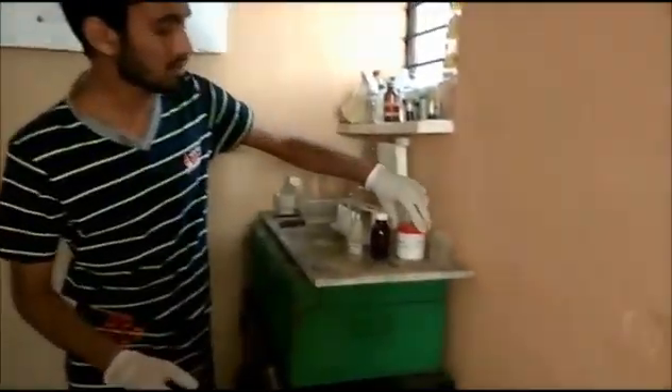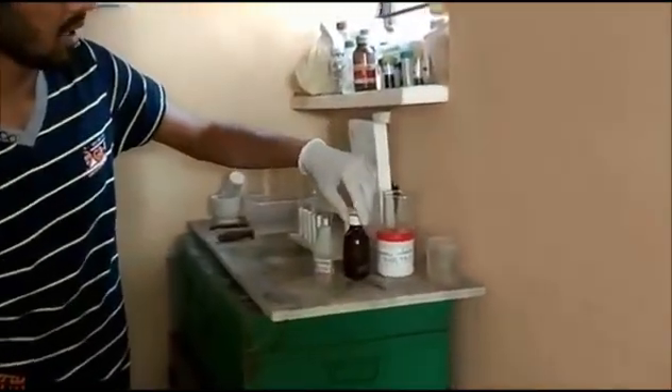In this video we would be doing the famous brown ring test. This brown ring test is used to detect the presence of nitrate ion, which is NO3-. All that you need for this test is some ferrous sulfate, some sulfuric acid, and some nitric acid.